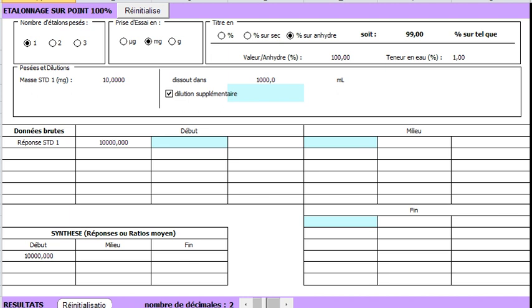Here you could enter the values of the internal standard if any. In this case, there is not. And here there is a summary of the average responses.